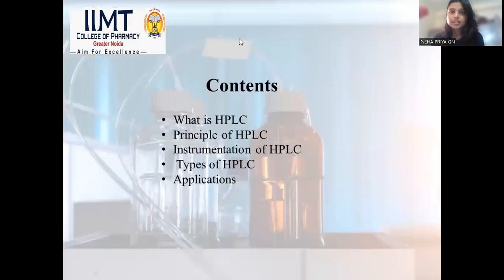The contents here are: first, what is HPLC; second, the principle involved in high performance liquid chromatography, along with its instrumentation, types and application. So let's get to the first topic, that is, what does HPLC mean.